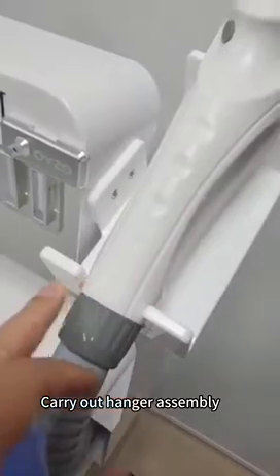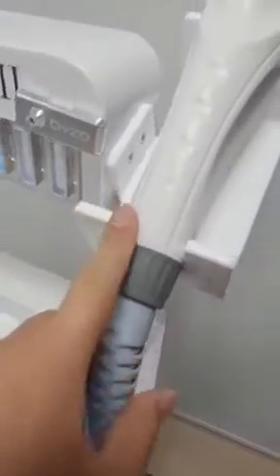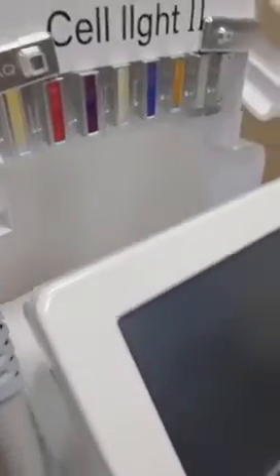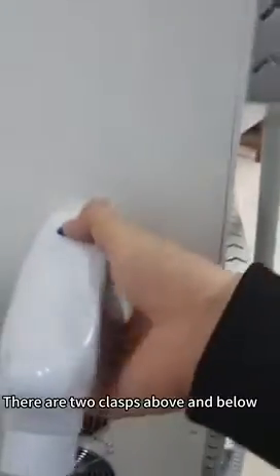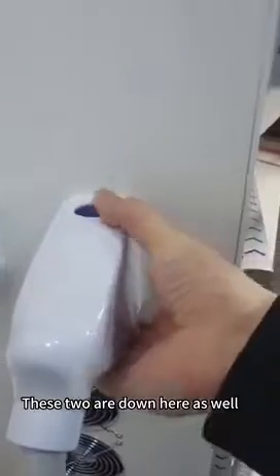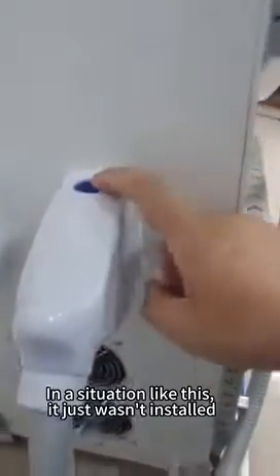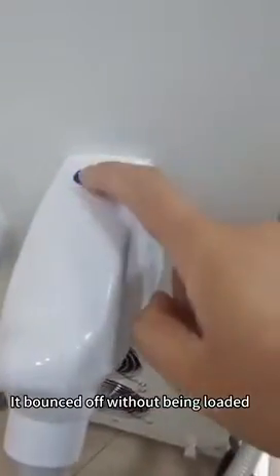Carry out hanger assembly. There are two screws — put them all in. Same thing on the other side. The handle has two clasps above and below. Move it up and down — you just need to hear a little bump. If it bounces off without clicking, it wasn't installed correctly.